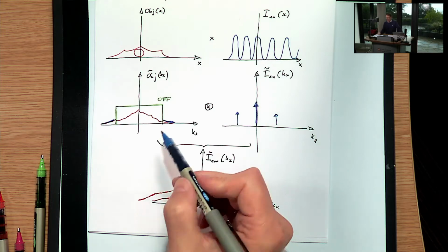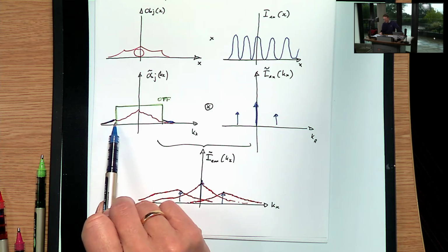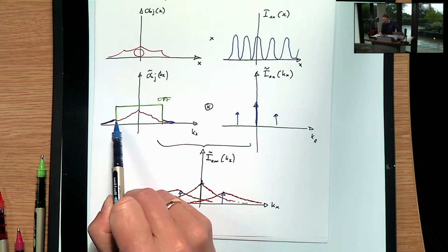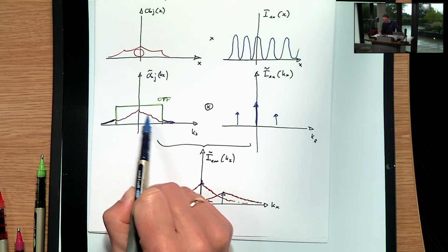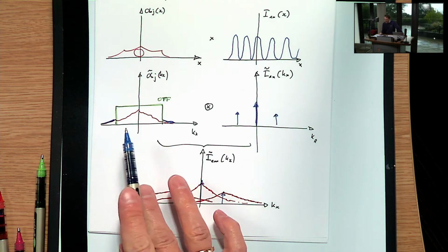And it's that process that caused, of course, Albert Einstein to disappear, because his mustache and his hair were somewhere encoded in frequency detail out here. And these frequencies here were much stronger for Marilyn Monroe's face, and so that's what shone through once you clipped those ones out here away. And so what does that then do?